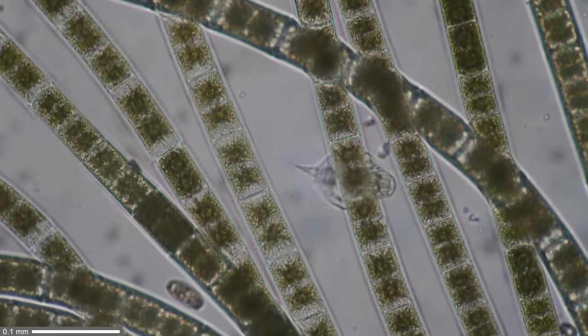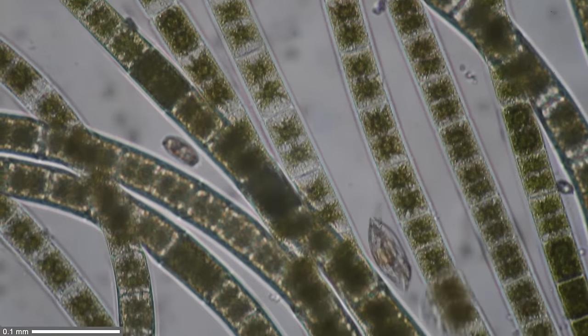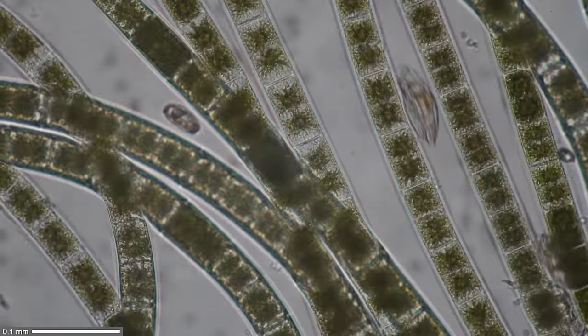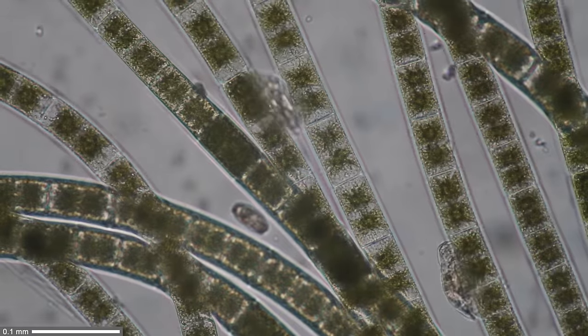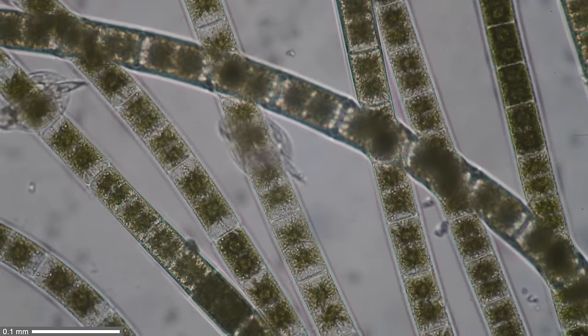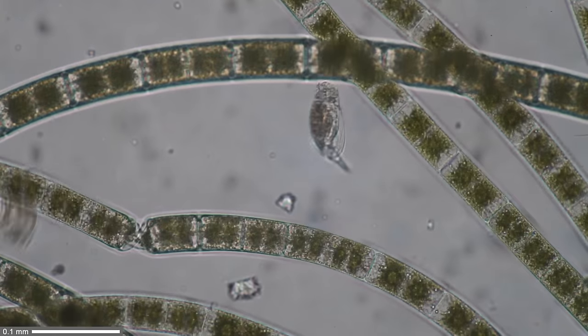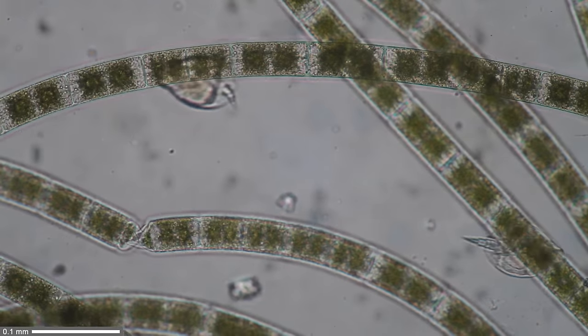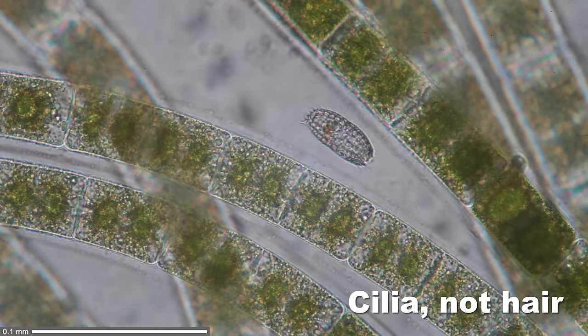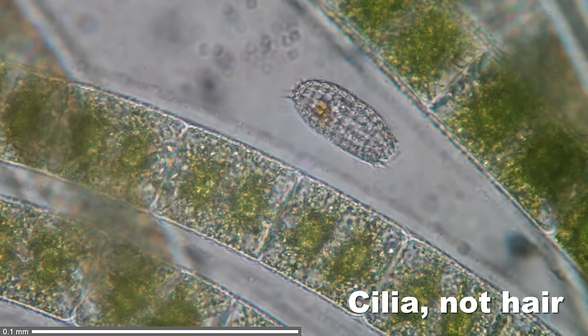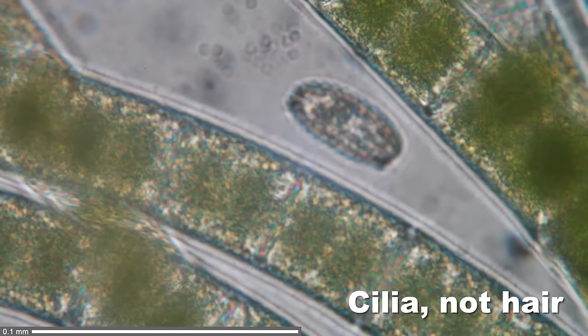There were a few of them moving around, quite interesting to look at. Something I did not do in this specimen—I should have done this—is to use dark field microscopy. I think this would have looked quite nice. I'm going to do this in the future, look at these algae using dark field. They're moving around happily looking for food. Sometimes I think they look a little like little spaceships. I don't know what this one is, it seems to be some kind of ciliate. You can see the little cilia moving on the surface. Moving to higher magnification still, you can see the fine cilia moving. This one is relatively small compared to the others.